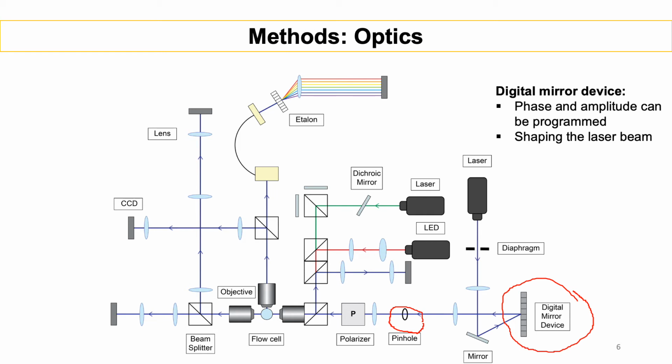When the donut beam falls on the flow cell, light is scattered into all directions, including the first direction, the forward scatter direction, where we capture the Fourier signal and the live image of the flow cell, which is handy to see if particles are present in the cell. We also have an LED in the setup for measuring the wide field image in the flow cell.